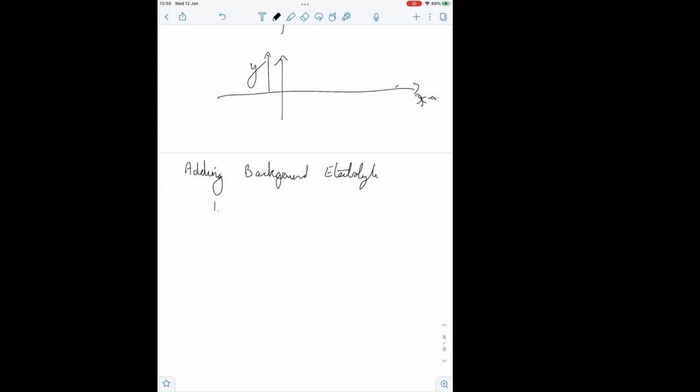Let's see if I can remember all four. One, to reduce IR drop. Two, to confine the region of drop in the Volta potential, so that the drop in the Volta potential happens very close to the interface. Otherwise, you have problems, you haven't got well-defined points for where the electron transfer happens.